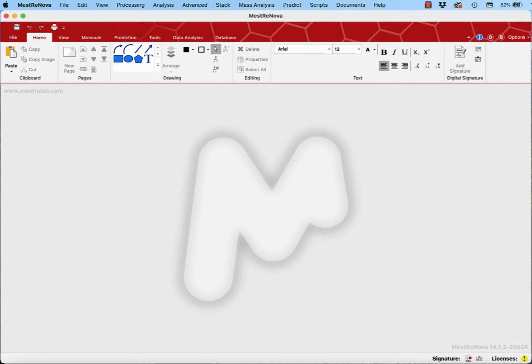Hi, I'm Lisa Nichols, and in this video I'm going to show you how to use the computer program MestReNova, which is a program used for processing NMR spectra. What that means is taking the file that the instrument gives you and loading it and editing it, adding peak frequencies, adding integrations, zooming in however you like, and that sort of thing.